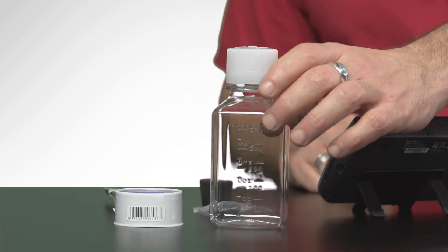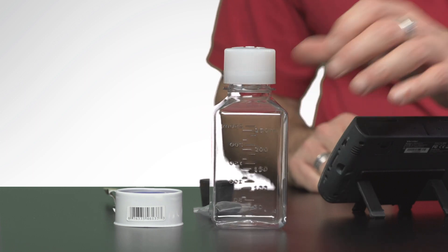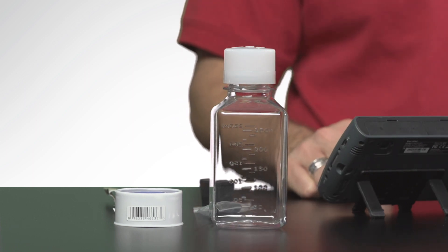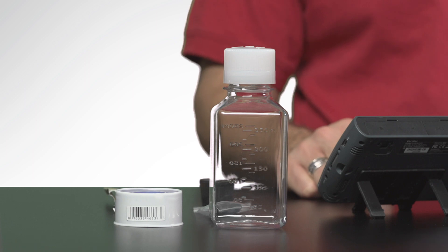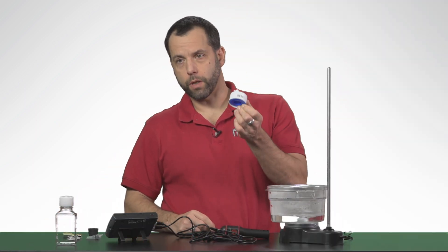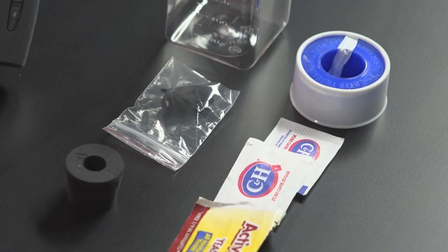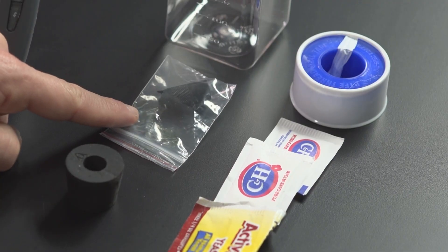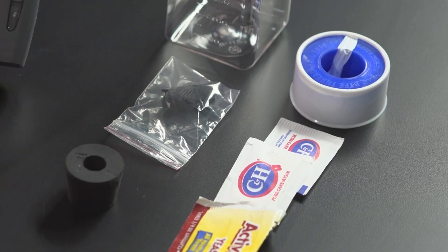Now, the sensor itself also comes with what we call a little fermentation chamber, or a little Nalgene bottle. It comes with a lot of Teflon tape, so that you can do a lot of experiments. It comes with a spare cap, just in case your students lose the original cap.